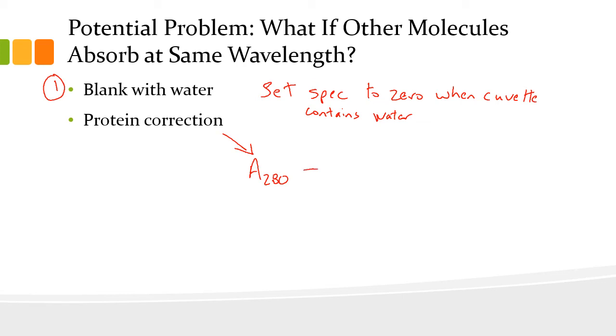So normally, we could do a test of how much protein's in the wine, but we use an estimate. And we estimate that our protein absorbance is 4. All right, so we back out 4, subtract 4. I say back out. Some people have never used that term. It's kind of a lab term. We subtract 4 from our absorbance at 280. Okay, so we'll blank with water. Then when we get our results, after we read our results, we'll back out 4 from the A280 number.